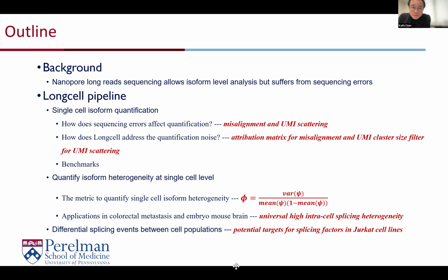Yeah, I think Nada has a little bit related question. The question is, is the data PacBio or Oxford Nanopore sequencing? I guess it's Oxford Nanopore sequencing. I mean, your algorithm is aimed at Oxford Nanopore sequencing, right?